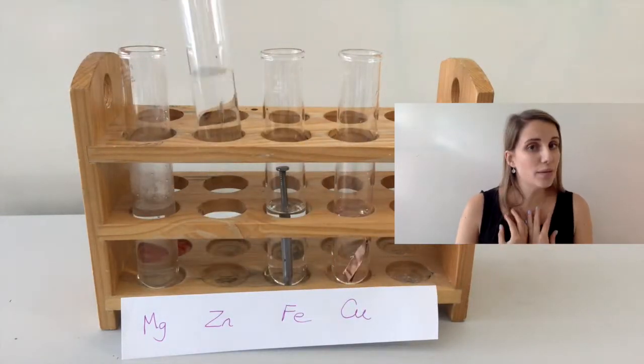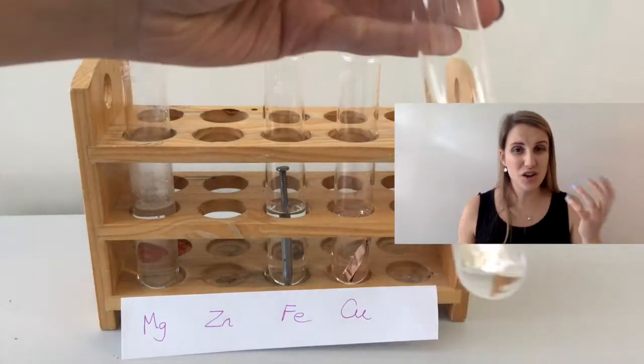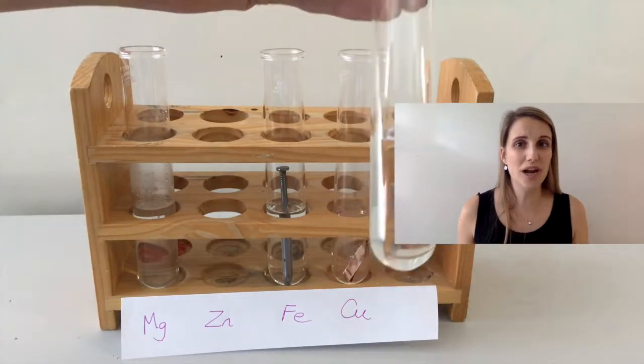Now zinc, although I know it should be next on the list, looks right now like it's not really reacting. But this is what the zinc looks like after about three or four minutes of reacting. You can see that the zinc is pretty much covered in bubbles. It just takes a little while to work through that oxide layer.